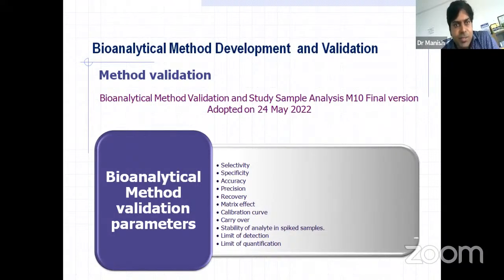But suppose it is a new drug application, here HPLC cannot give that much information, right? Because we need to go for structure elucidation. So if it is hyphenated with LCMS or tandem with any mass spectrometer, it gives wider information about the drug. People who are interested in knowing more should know how to handle LCMS also, for better knowing the possibility of this method in the future.